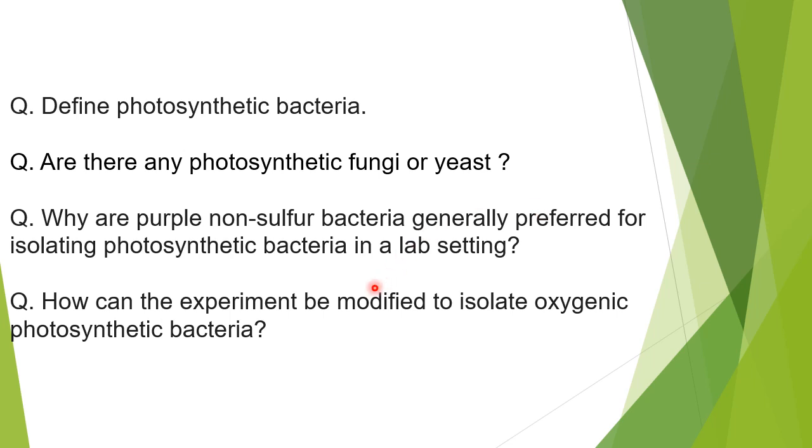Now, why are purple non-sulfur bacteria generally preferred for isolating photosynthetic bacteria in the lab? Because they have simpler growth requirements compared to the others, and their distinct coloration, that is the purple color, simplifies the identification in the culture.